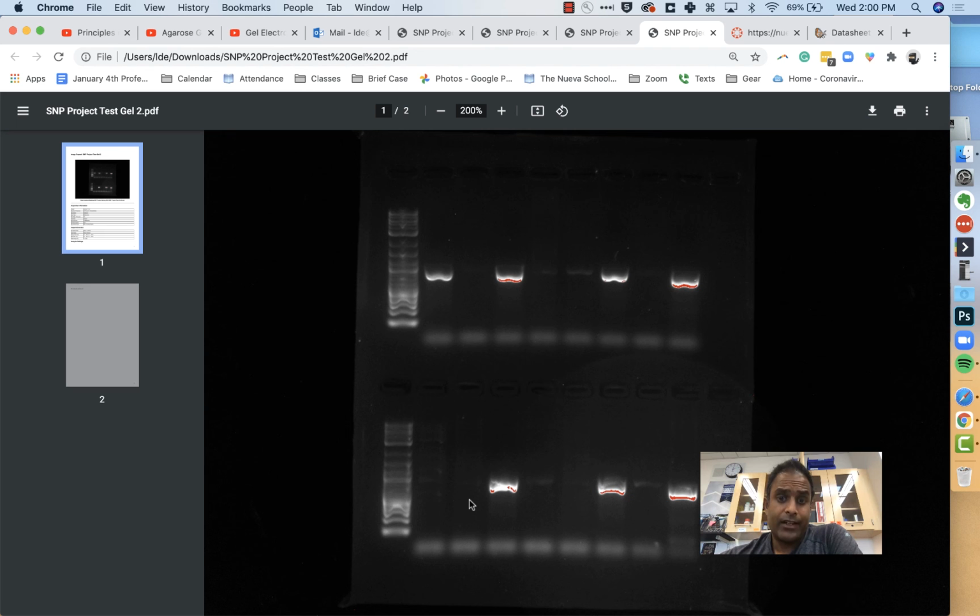This was a crash course in looking at gels. I know everything I said didn't make sense, but I want you to watch it and see it anyway. It will always make more sense the second time you see it. I don't want Monday to be the first time you see any of this. I want it to be the second.